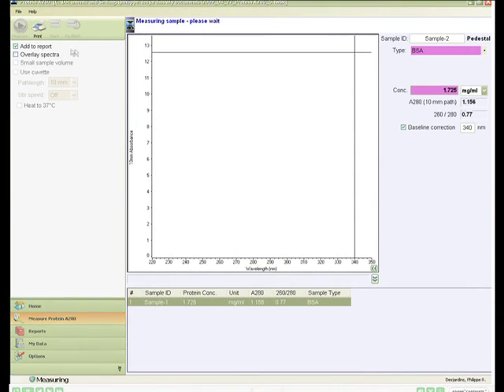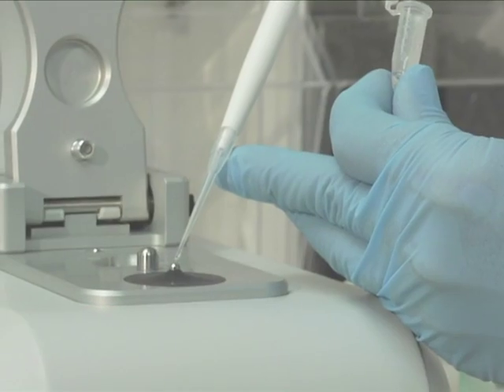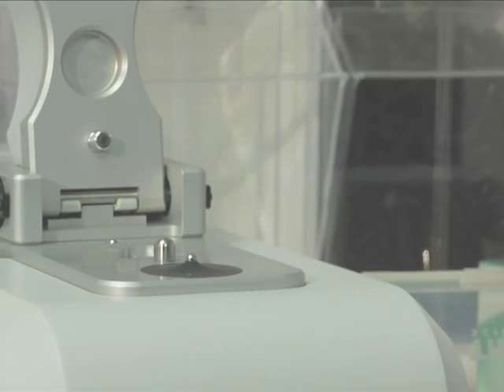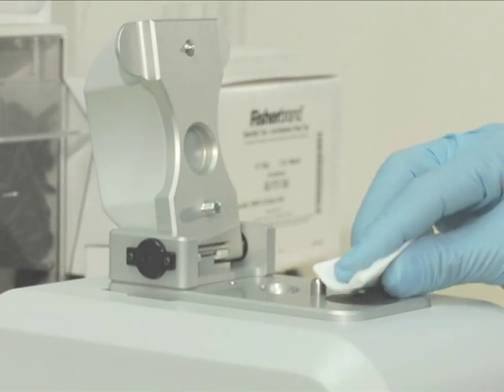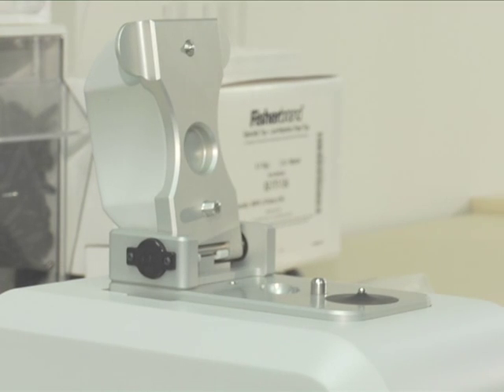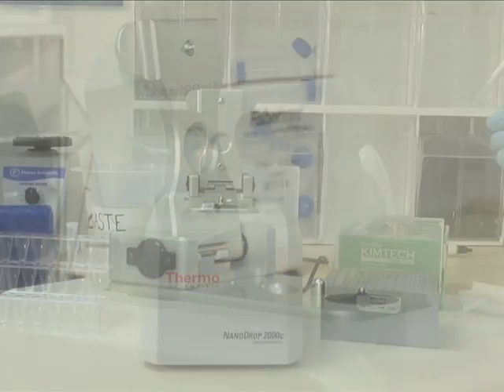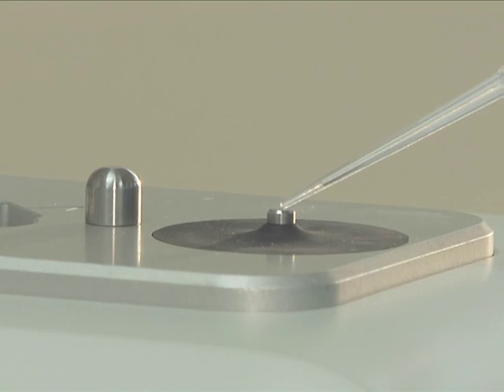When measurement is complete, wipe the sample from the lower and upper pedestals using a dry laboratory wipe. Measure all other samples in the same manner, using a fresh two microliter aliquot for each measurement. An ordinary lint-free laboratory wipe is often sufficient for cleaning the optical pedestals between measurements. The only solvent that is incompatible and must not be used is hydrofluoric acid. Solutions and reagents containing surfactants may uncondition the measurement pedestal surfaces over time, preventing formation of the sample liquid column.